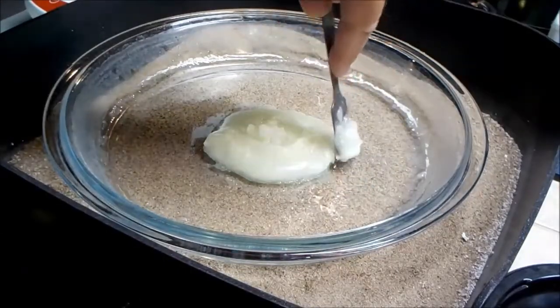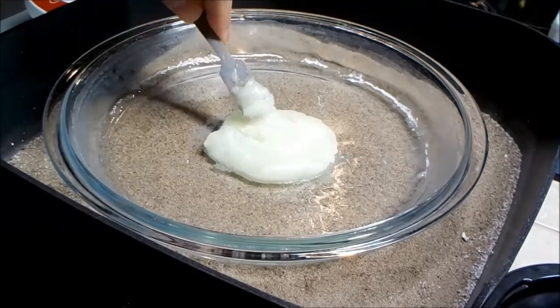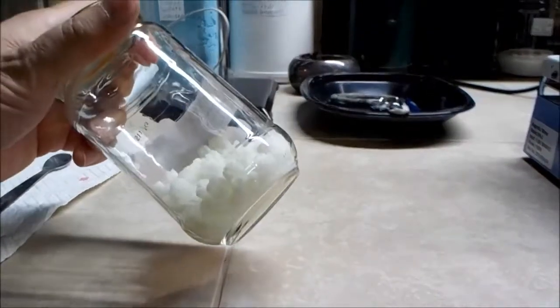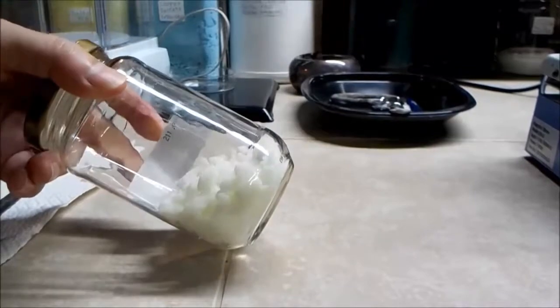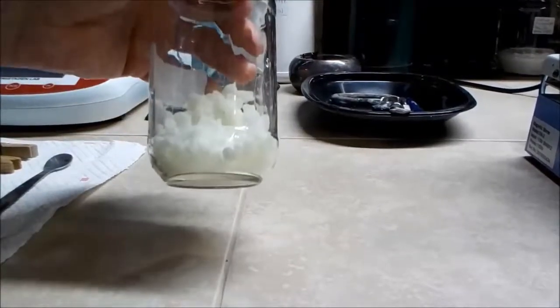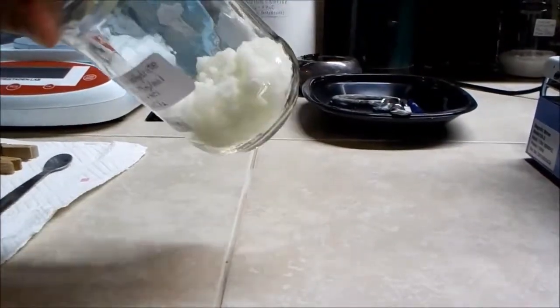I imagine if I let it sit long enough it would eventually all end up as a liquid again, but for now it's fascinating stuff to play with. So here is the calcium chloride that I remelted because it was too hard to break up. I washed it carefully as it cooled and as it started to freeze I made sure to keep it broken up into smaller chunks, then put it in this airtight jar. You can still see the greenish tint from the iron impurities, but it makes for a very interesting looking substance.